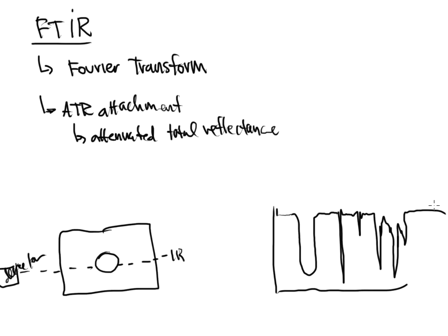A normal infrared scan takes about 2 to 3 minutes. When we're running samples, we have to wait 2 to 3 minutes in order for that processing to complete. The FTIR, though, will capture everything in about a 30-second or less time frame.